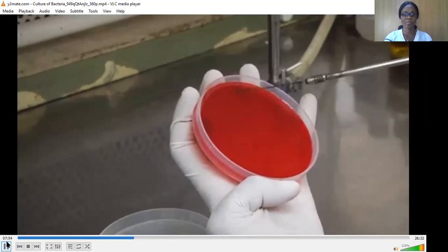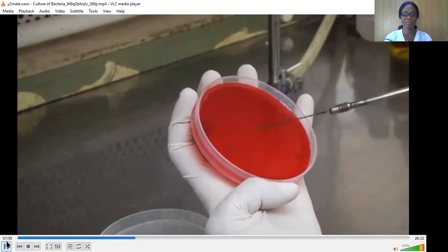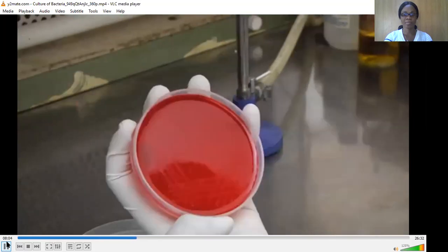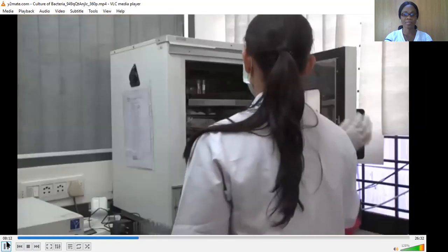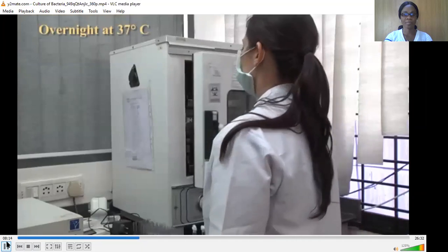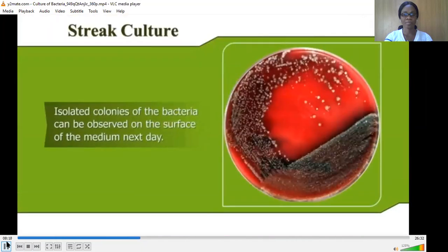Repeat the process till the surface of the medium is adequately covered, taking care to sterilize the loop after each inoculation. At each step, the inoculum is derived from the most distal part of the immediately preceding strokes. Close the lid of the plate and incubate it overnight at 37 degrees centigrade. Isolated colonies of the bacteria can be observed on the surface of the medium next day.